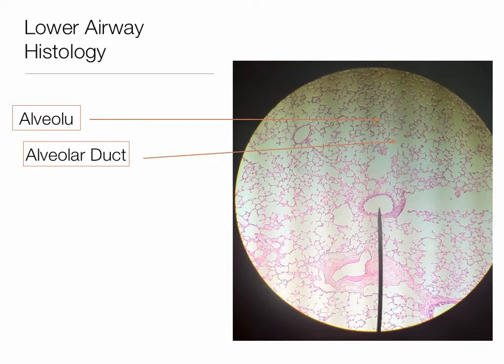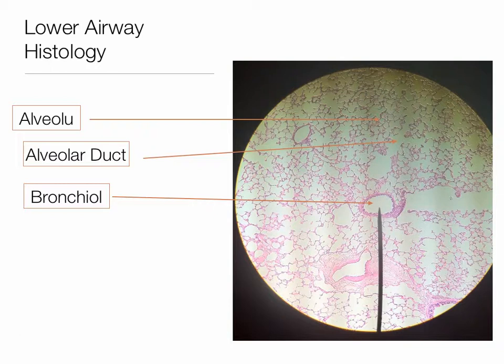I also have an alveolar duct — this is where the respiratory bronchiole kind of ends, and I have ducts with grape-like groups of alveoli branching off. Then I have a bronchiole — this is before we get to the respiratory bronchioles. If you look closely, you can see some pseudostratified columnar epithelial tissue there. Of course, we don't have that pseudostratified columnar epithelial structure in the alveoli themselves. You can really appreciate the stark contrast between the bronchiole and the alveoli.